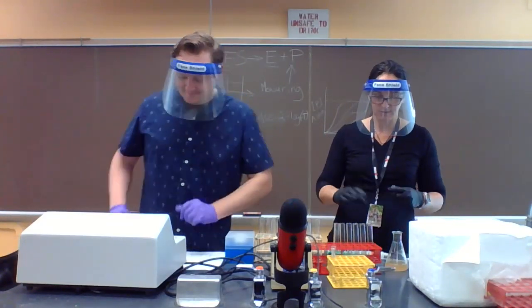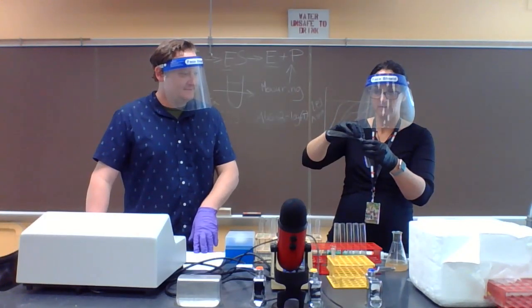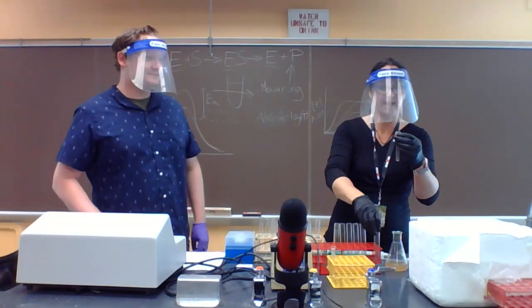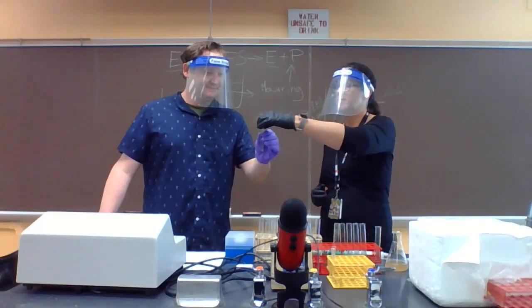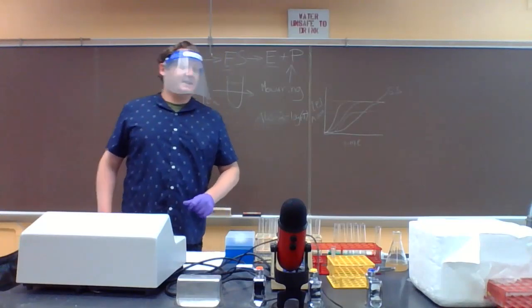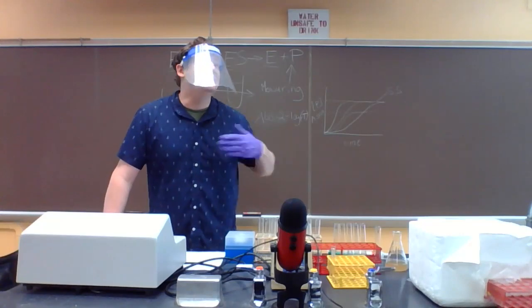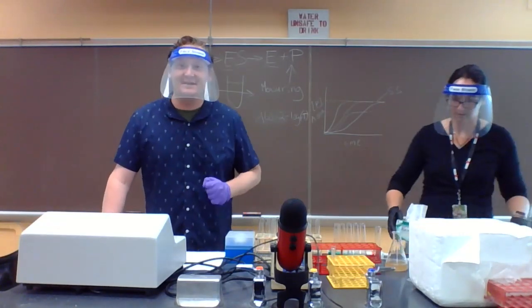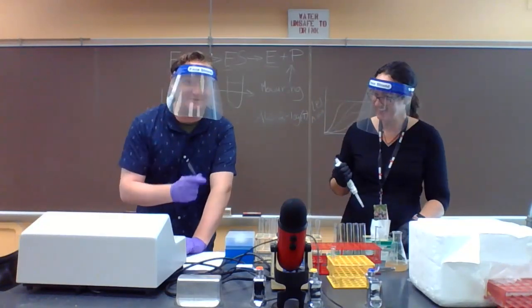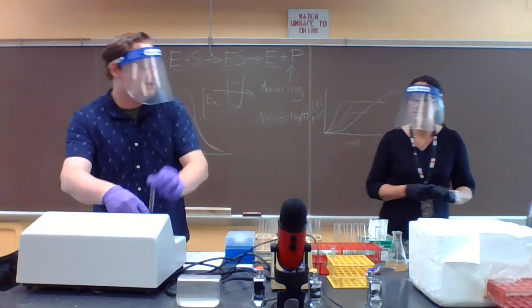All right, so tube number 1. So this is the endogenous potato. It's got no catechol in here. We're just seeing how much of the potato on its own is turning brown. I'm going to grab some wipes. Fantastic. And yeah, as soon as we add the catechol in, we will begin our timer and then start our sequence of adding every minute. Okay, whew, you ready? This is pretty exciting. This is a stressful lab usually, so here we go. We got a nice 81% transmittance value in our endogenous.